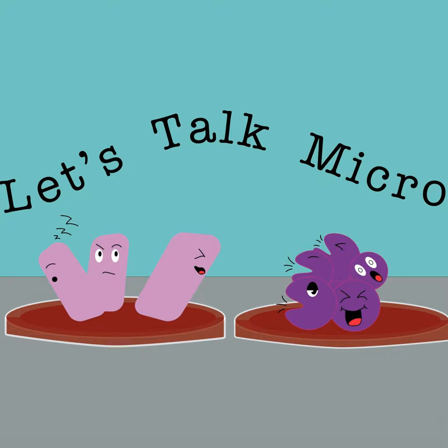And so I just had some questions about maybe if we can talk a little bit about the Oxford Nanopore technologies, and then, how does it work, and how do you analyze the data?